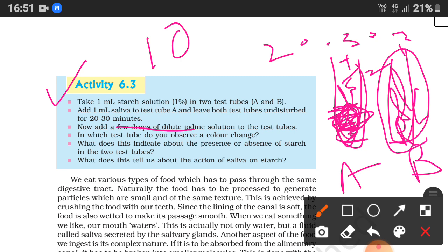In test tube A, there is no starch because salivary amylase acted on it and converted it into simple sugar. Iodine does not give a blue-black color with simple sugar, so there is no color change in test tube A.